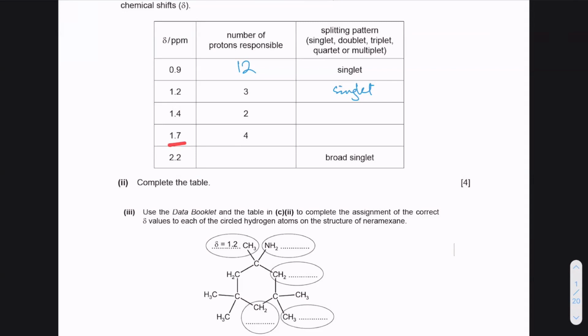with 1.7. अब 1.7 पे ना 2 हो सकते हैं, एक alkyl वाला हो सकता है, मतलब ये भी हो सकता है, और 1.7 पे NH वाला भी हो सकता है, ये वाला भी हो सकता है. अब लेट्स सी कि 4 कार्बन्स इसको रिस्पॉन्ड करेंगे, 4 हाइड्रोजन इसको रिस्पॉन्ड करेंगे, या 2 हाइड्रोजन इसको रिस्पॉन्ड करेंगे. लेट्स सी. सो NH2 के साथ वाले कार्बन पे इधर 2 हैं और इधर भी 2 हैं. सो दैट इज गोइंग टू बी द 4 कार्बन थिंग. ठीक है, सो ये 1.4 वाला है और ये 1.2 वाला है. सॉरी, ये 1.4 वाला है और ये 1.7 वाला है.